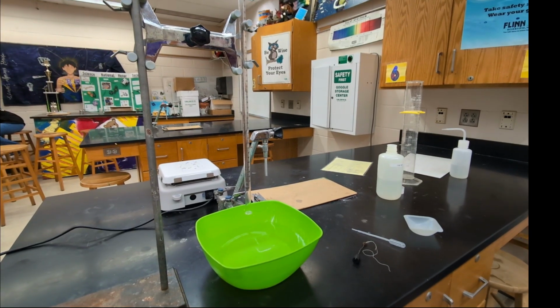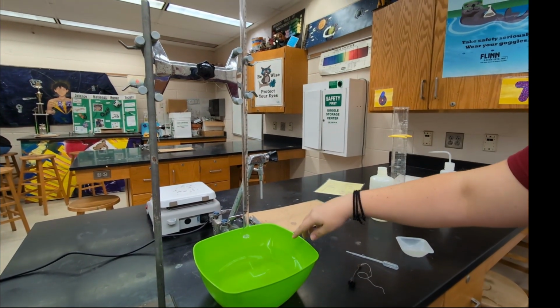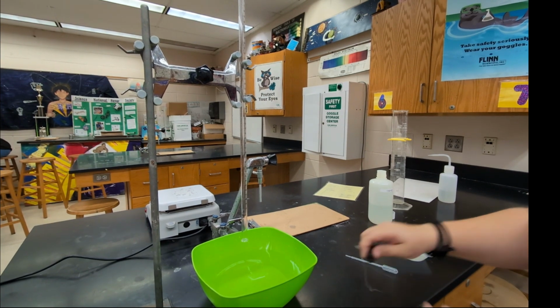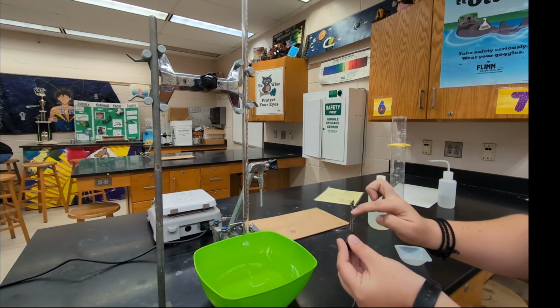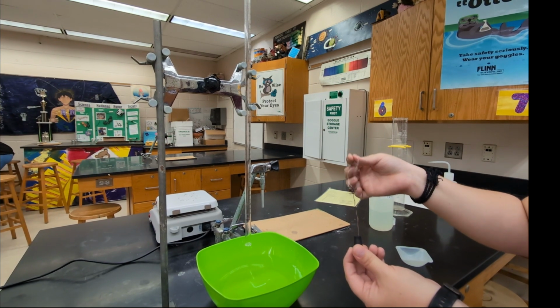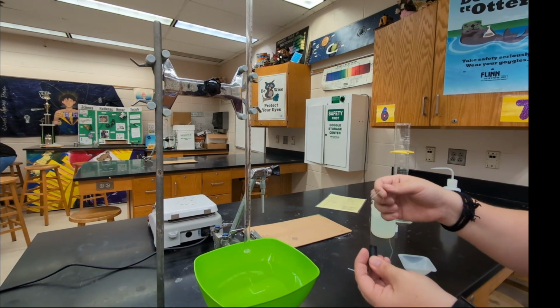Okay, so for the actual lab setup, you need a eudiometer, which is basically just a graduated tube. I have a bowl of just tap water. I have this stopper, which is a rubber stopper with a hole in it, and I have some copper wire. And I've attached a piece of sewing thread to it. The copper wire is good because it doesn't react, and then the sewing thread is going to attach the magnesium.